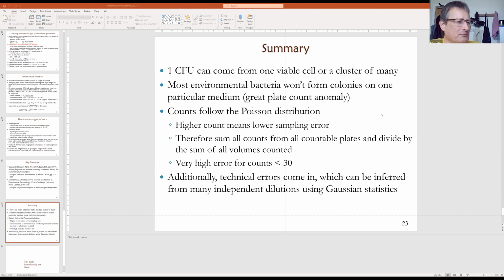In terms of the problem of CFU counts and how it's done, if people don't report how they do it, I would generally assume that they do it in what I think is a normal way, just based on my experience with many labs and many people, how they are doing it. And this is just excluding plates with a high number of colonies, excluding plates with a low number of colonies, and just counting the plates that are in the range of 20 to 200 or so.